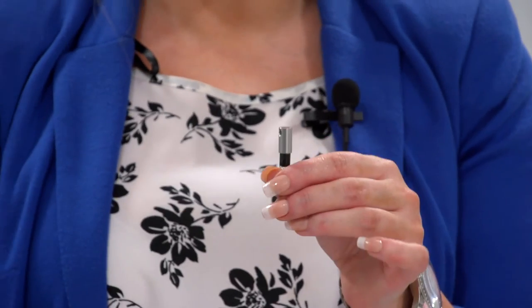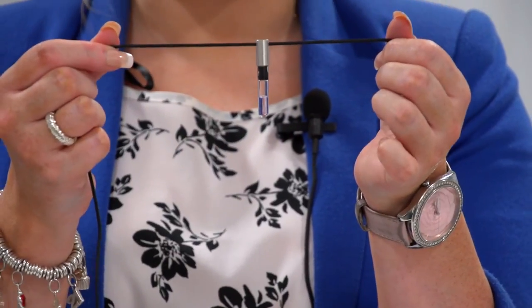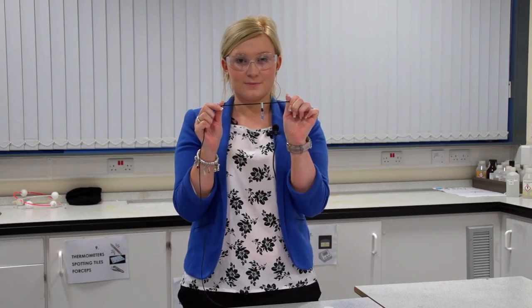Once your teacher has applied the super glue and silver cap, you can thread through your string and wear your DNA necklace.